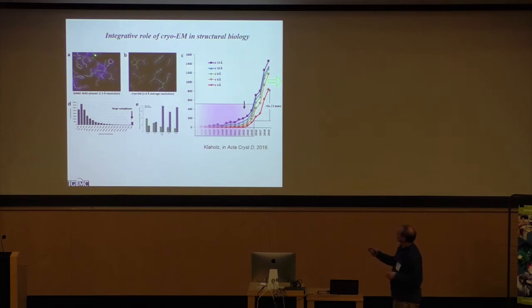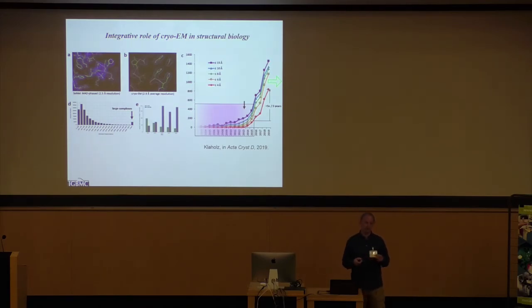A few years ago, this was what you would get with X-ray crystallography, and you can still do that, and it's very important to keep that tool. We should not just compare things, because for drug design, it is much easier to go for crystallization. But you see what the maps can look like nowadays, and you can also do drug design provided the complex is stable enough, and you push resolution. And this is a recent comment in Acta Cryst. So you see, this is a PDB contribution.